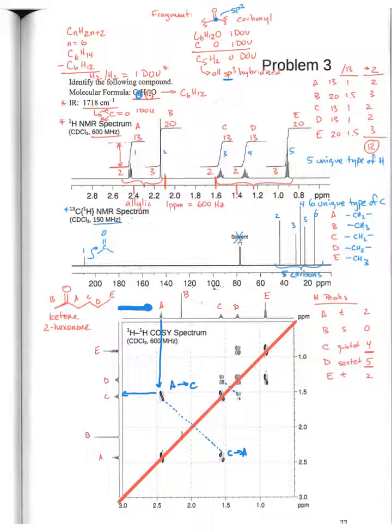We do that same thing here. We have CD or DC. This would be D coupled to E, E coupled to D. So basically on either side of that diagonal is basically the mirrored coupling that you have to observe. So what do we do with this information? Let's go ahead and tabulate it here beneath our proposed structure.